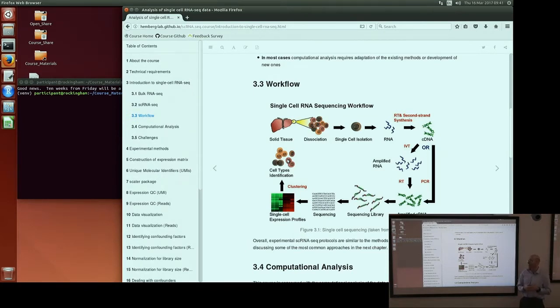And pretty soon there were methods that were specifically devoted to RNA-seq out and about, and they were doing a lot better. The same thing happened when single-cell RNA-seq was introduced. People started off by using what they had and what they were familiar with, and those methods work, but they're not fantastic. And it turns out that it's relatively easy to improve the performance by having methods that are specifically designed for single cell rather than for bulk RNA-seq data.